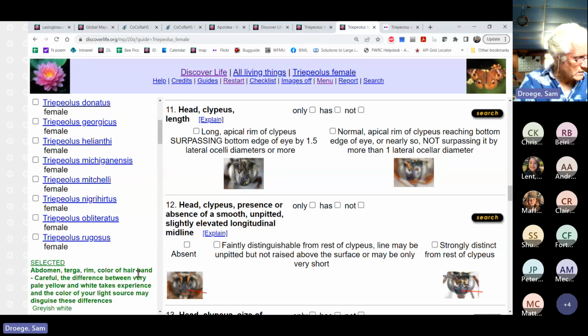So let's see if we can show you something that makes any sense whatsoever in terms of this color with the contrasting all white things. So I think you're getting the point that these are a little difficult to define in terms of white, not white. So look in here, these specimens are a good one.